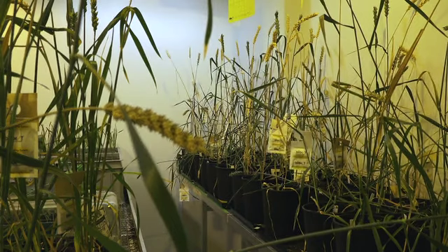Once you have determined your target, so which piece of the gene that you want to mutate, you have to choose your application. So, for example, if you have a Cas9 protein, you can modify this Cas9 protein to make a base editor. So instead of simply cutting the DNA in that particular case, you are modifying specific residues in the DNA without making a cut. So these are all types of choices that you need to make at that point. What type of edit do I want to make?